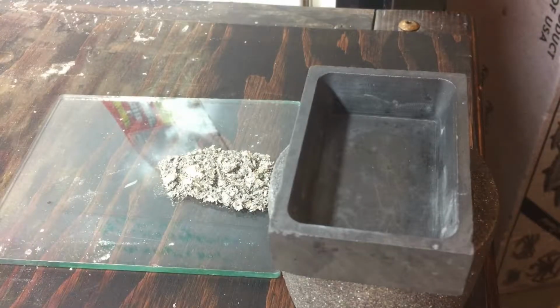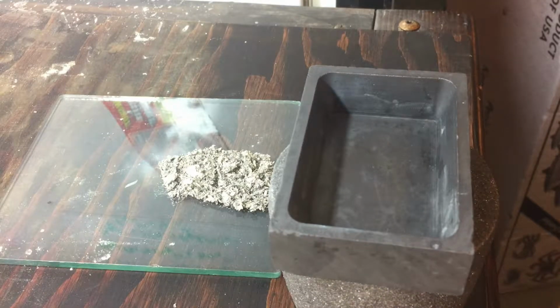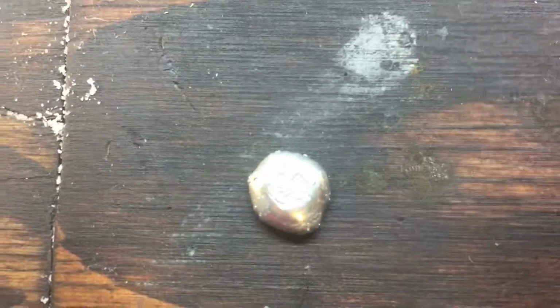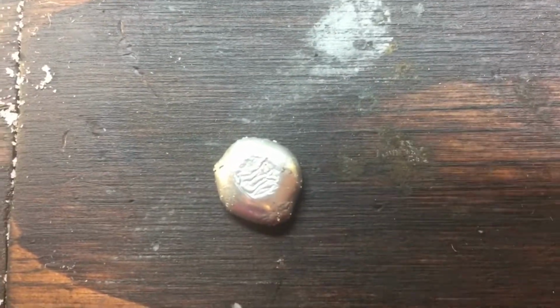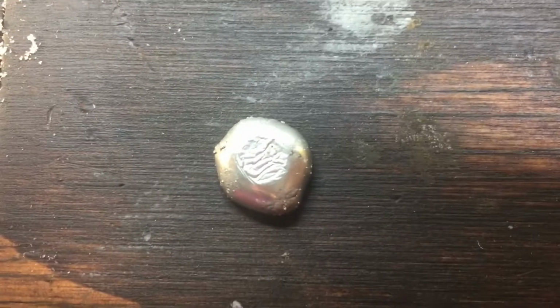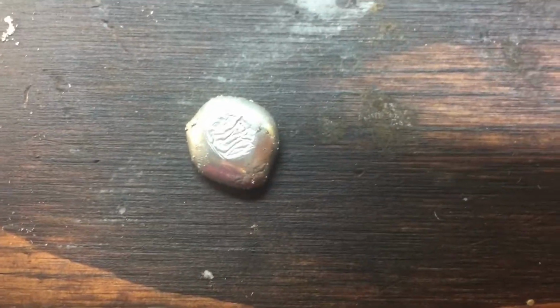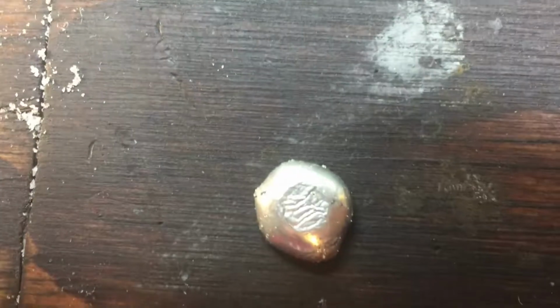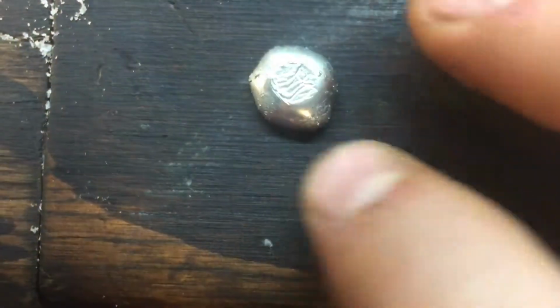In fact, one of the first uses of this tin is going to require it being melted into a single billet, so I'll do that real quick. Here's the little billet. I'd imagine it's upwards of 99.9% pure, probably, because the tin I started with was, I think, over 95%, but the electrolysis definitely removed a lot of insoluble impurities and thus made this much more valuable little piece of metal.